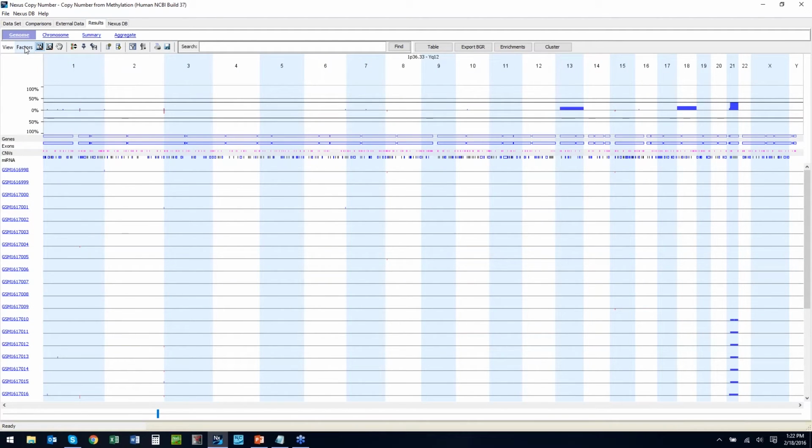I'm going to add a factor here of our CVS FISH results. Again, these were already processed by FISH, so we already knew what the result would be, and this is a way for us to confirm that we are seeing what we expect. On the top here are all of the samples that had a normal FISH result, meaning that there were no gains or losses of large chromosomal regions. This test was looking for trisomy of 13, 18, and 21.